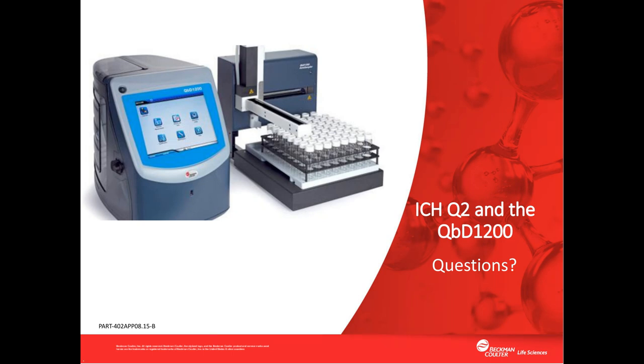For sure, definitely. So yeah, human error, if it creeps in the test, in the configuration of the instrumentation, it can cause problems with data integrity. Now, in the FDA's ALCOA acronym, as I mentioned in the presentation, the final A in that acronym refers to the accuracy of the electronic record itself. So we're not talking about security or anything like that. It's really about the data in the electronic record.